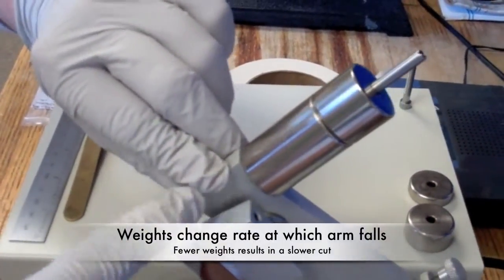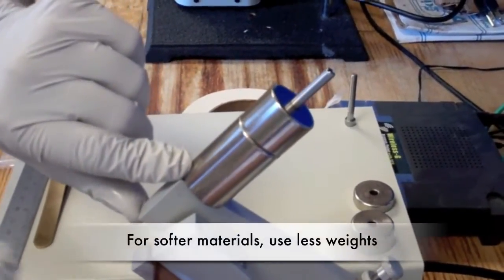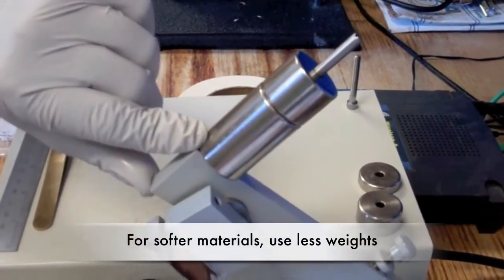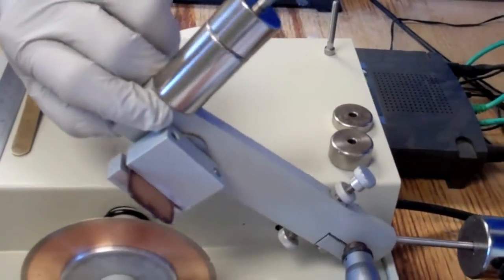The samples are weighted down with these weights. These weights dictate the speed at which the arm falls or the speed at which the cut is made. Fewer weights used results in a slower cut. Soft materials should use fewer weights to create a uniform cut.